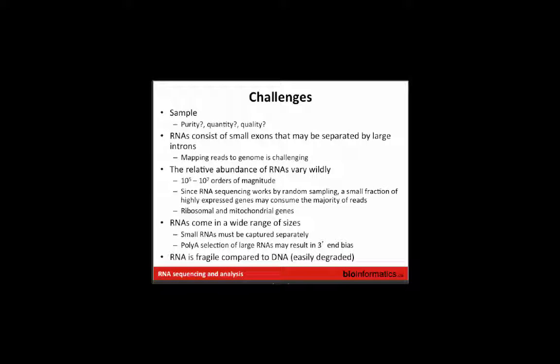So there are a number of challenges to RNA-seq that generally are much less of a problem for people doing DNA sequencing. These include purity, the sample purity, though that issue could apply to DNA as well. Quantity, of course, is always a problem, but really it's quality that people seem to encounter problems with for RNA compared to DNA, just because RNA is so much more fragile than DNA.